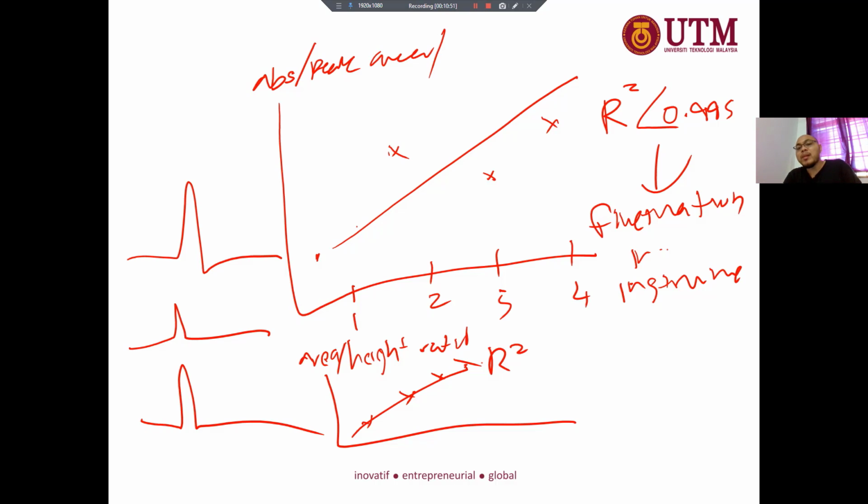So you need to combine the internal standard and the standard addition. Pray that never happens in your life. But in my case, mostly the analyses using gas chromatography will have that kind of problem.